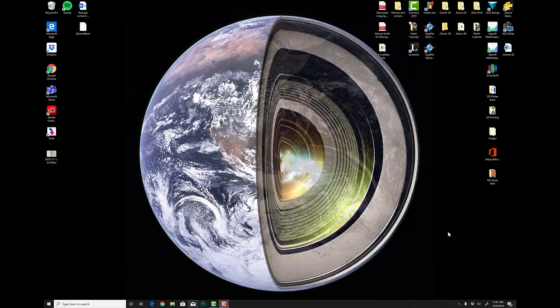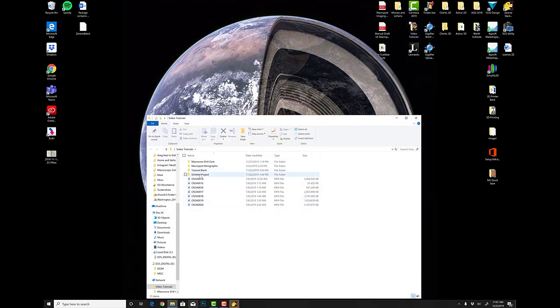Alright, so all of our images have been captured. So now what we're going to do is go through and stitch them together. These particular slides are actually being photographed for a client's interest. So I went ahead and took a few more images at higher magnifications, using the micro kit with the 50x objective and the 20x objective.